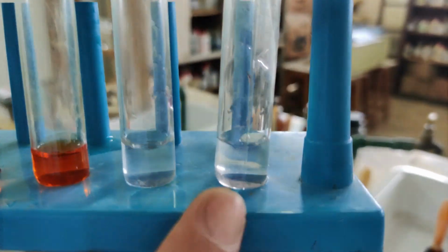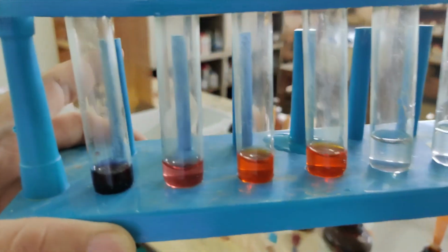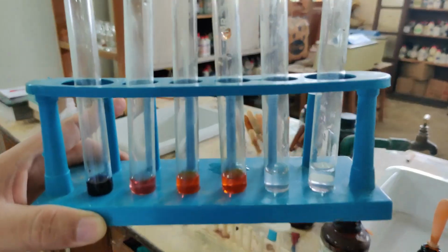Then in both these test tubes I have added phenolphthalein. Because one I am going to test with acid, the other one I am going to test with base. Now you see the original color, these are the original colors. Since I am going to add drop by drop, now you can see the 2 solutions which I am going to use.